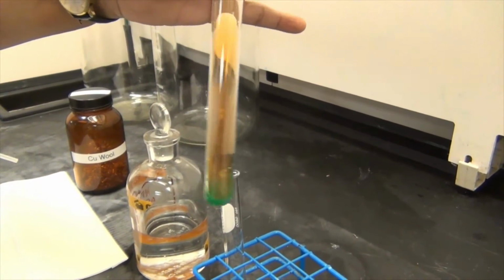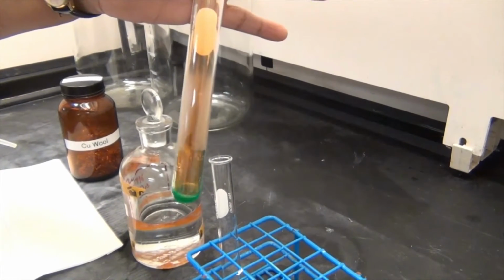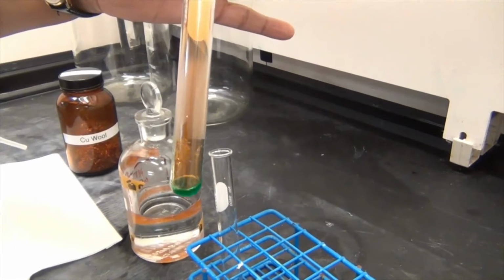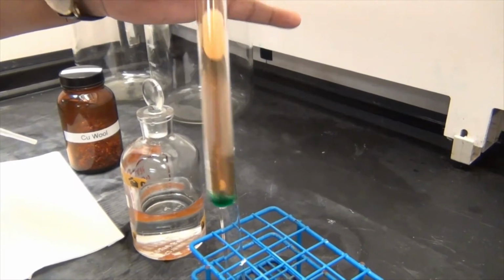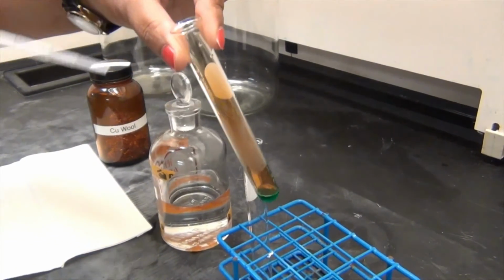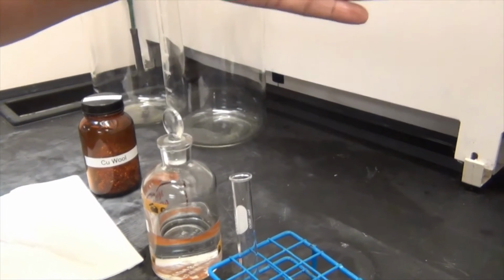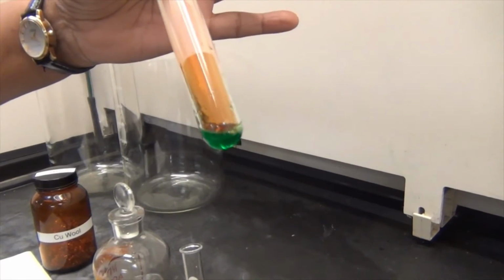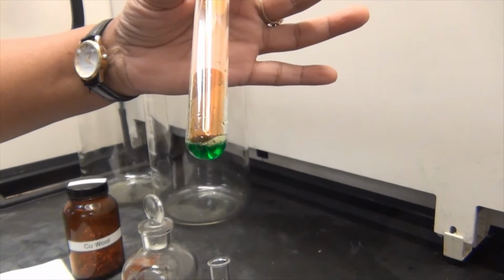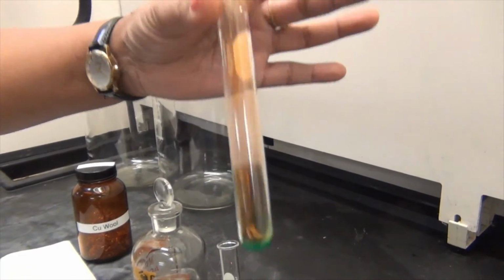And you can see I'm doing this in the hood because I guess you can tell from the reaction what's going on. So I don't want to smell all that gas that's coming out. And we just add one more drop. And I'll stop now. The main thing over here that I want to make sure is that I have no copper left behind. Okay, so I don't think I have any copper left behind. That was the first step, okay, that we did. Okay, now I'm going to have to move out of the hood.